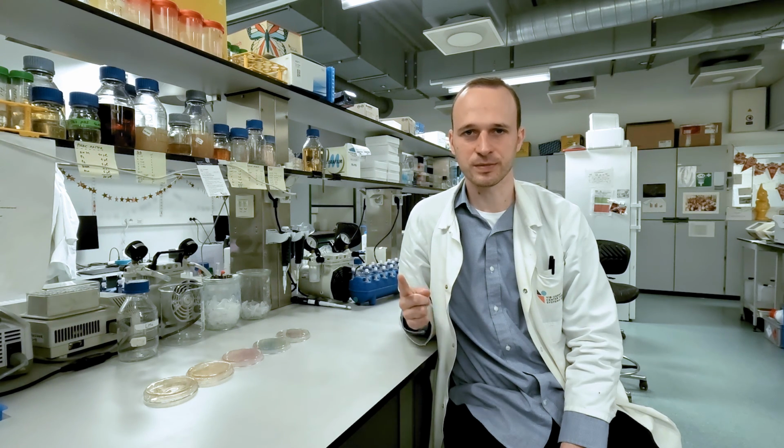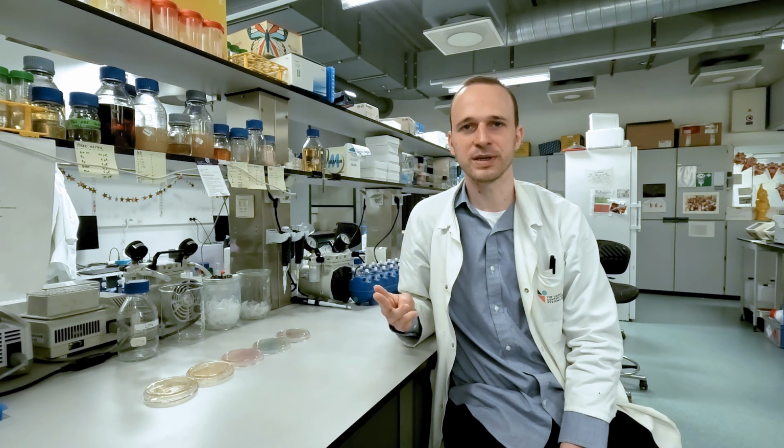In short, we are trying to overcome the limitations of design standards. I have found that oligo stitching is a very useful method for the 4 applications that I've described to you: clone conversion, incompatible parts assembly, de novo parts assembly, and mutagenesis.